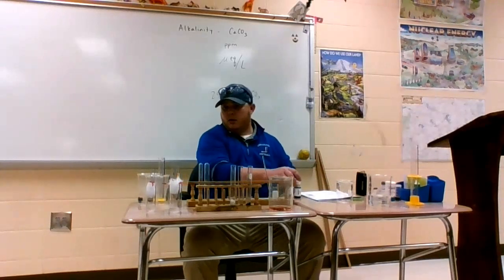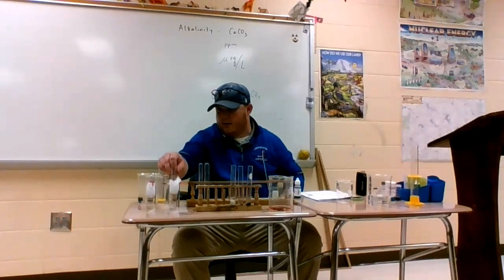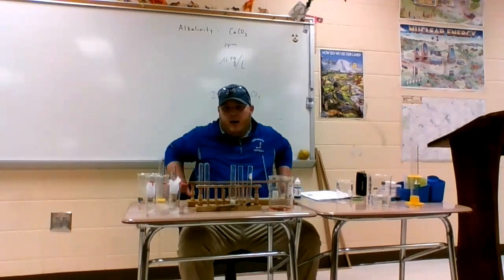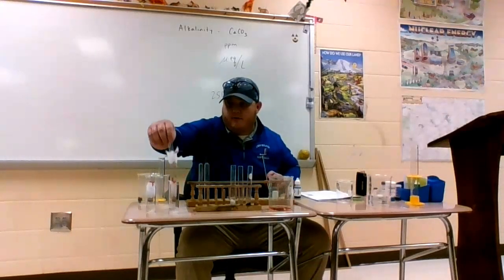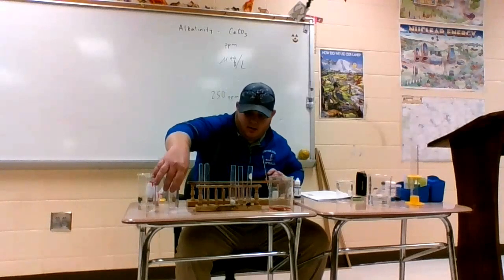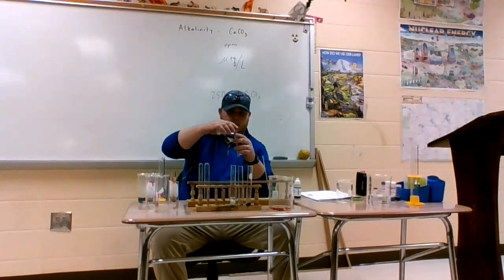All right. We are not getting any drainage through here. I thought that was really fun. The lizard people. All right, so let's do the same thing with what we filtered off through sand. I don't think you're gonna have enough clay to do that. Yeah. We'll have to force it through or something.